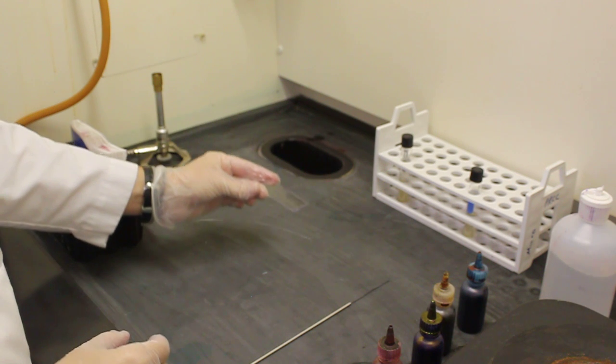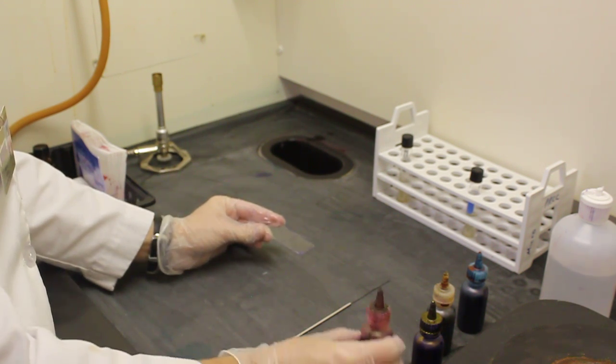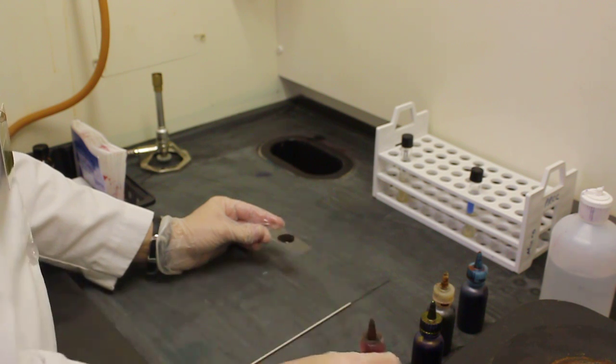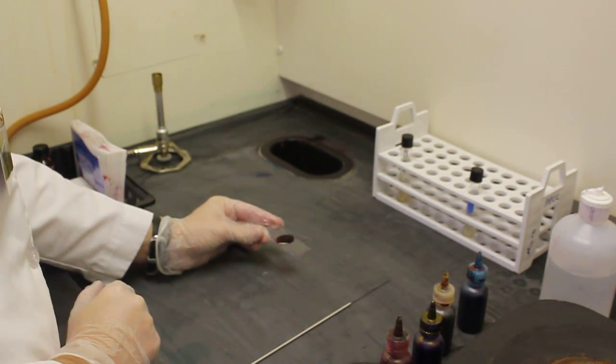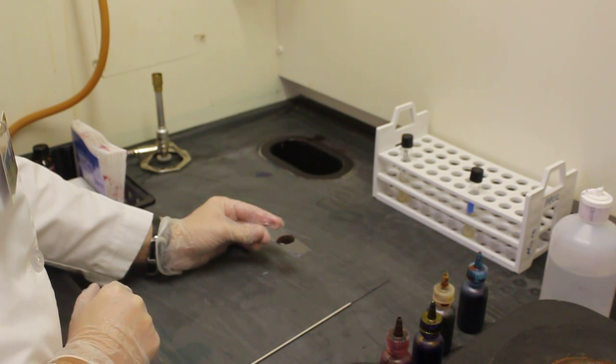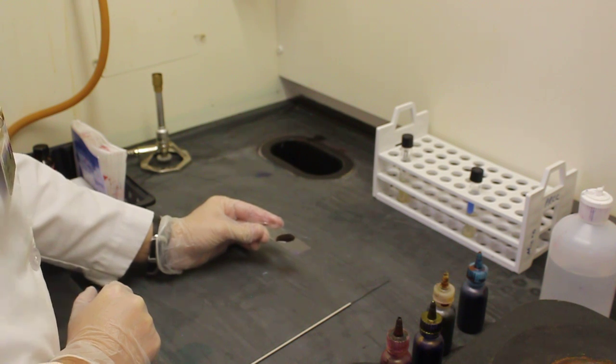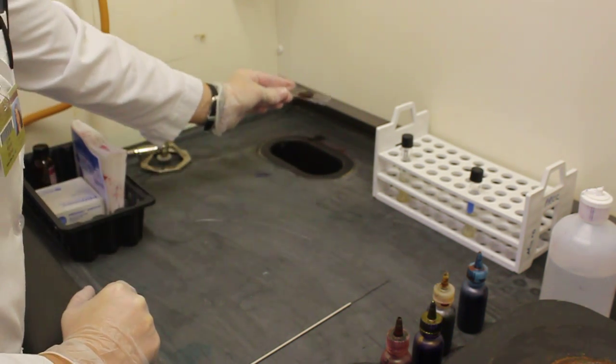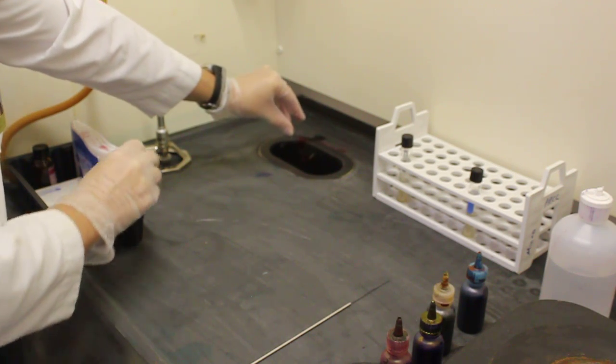I am now ready for step four, the safranin. I apply the counter stain. At this point my gram negative cells will turn pink. My gram positive cells never lost their purple color when the decolorizer was added. I allow the safranin to sit on my slide for one minute. Once one minute has passed I will shake the excess stain into the sink.